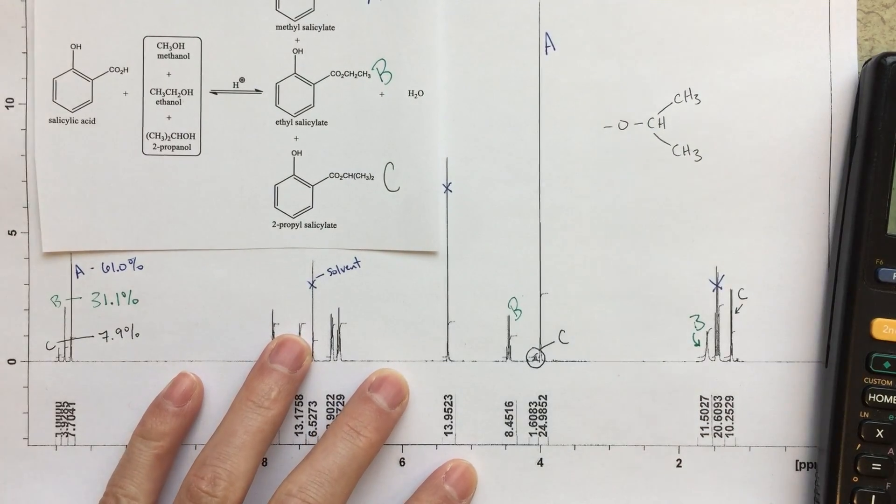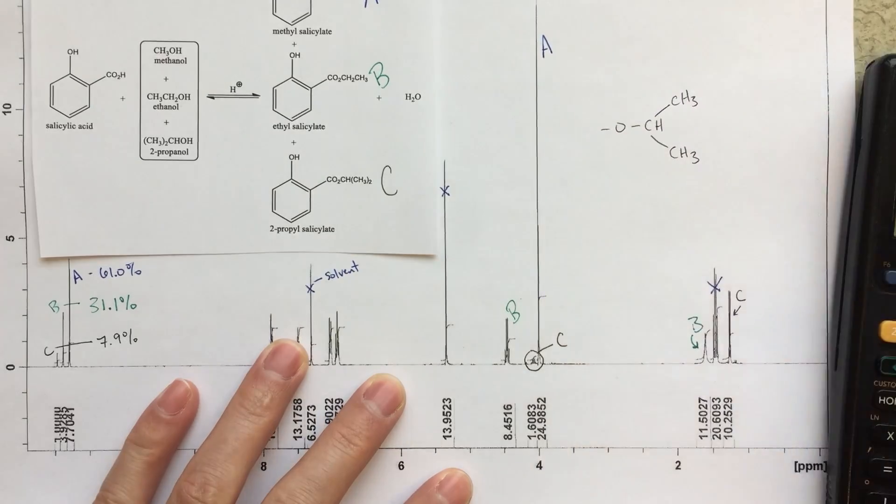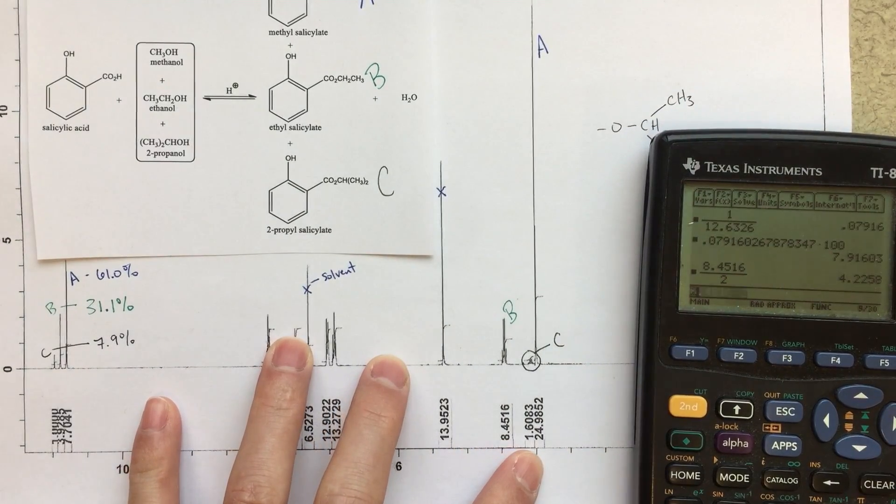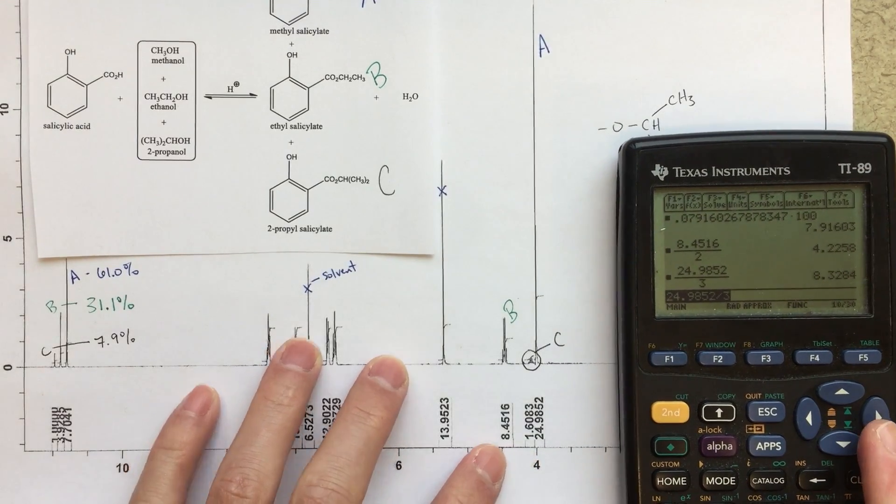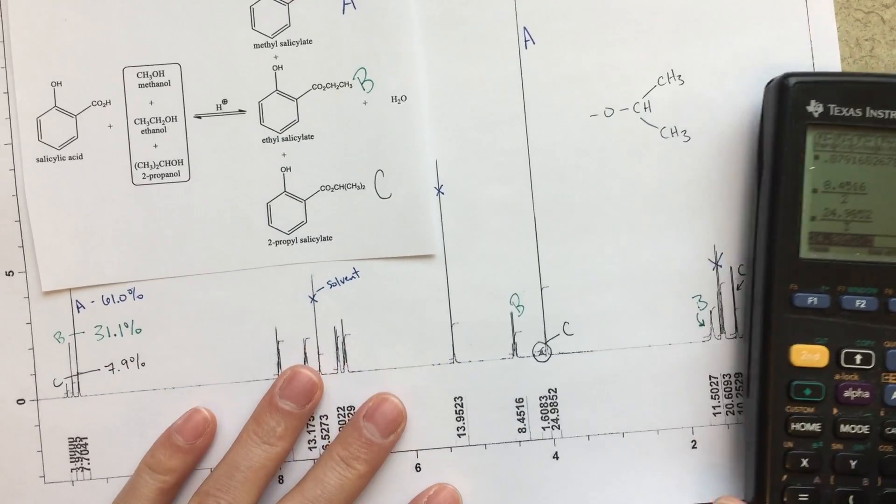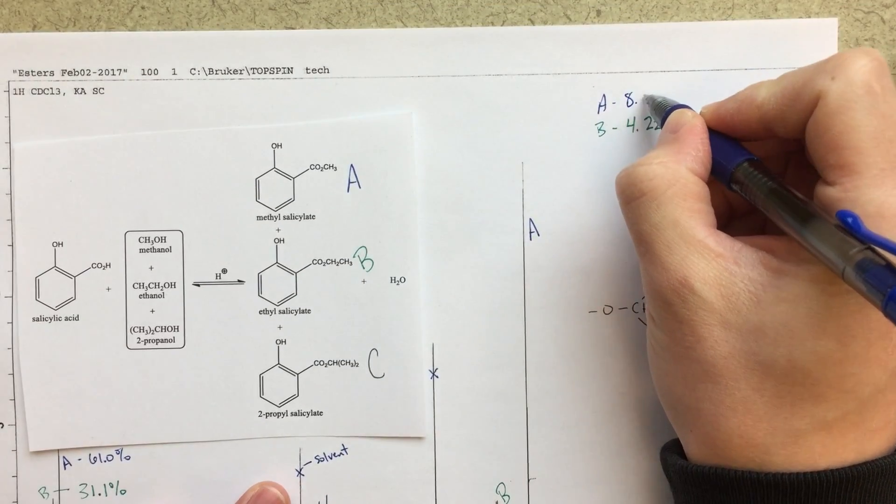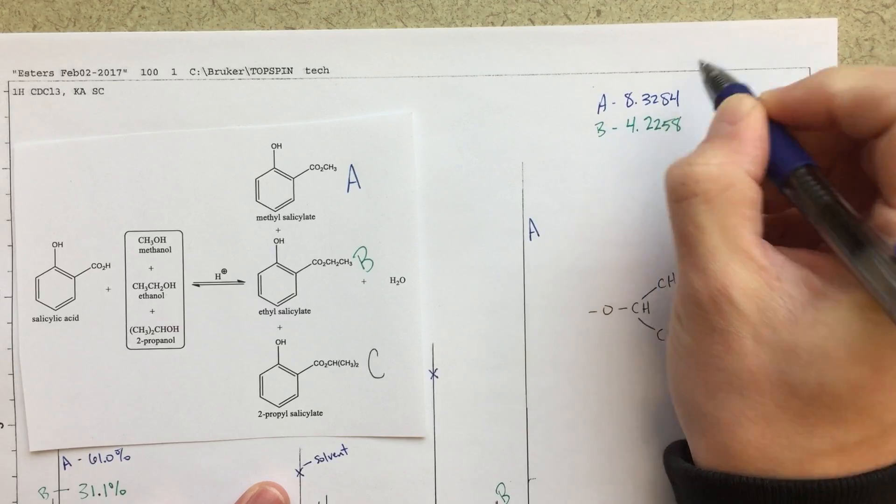For A, we'll do A on top, I guess. I'm going to take 24.9852 and divide that by 3. Dividing by 3, again, because that's 3 proton equivalents. So this becomes 8.3284.